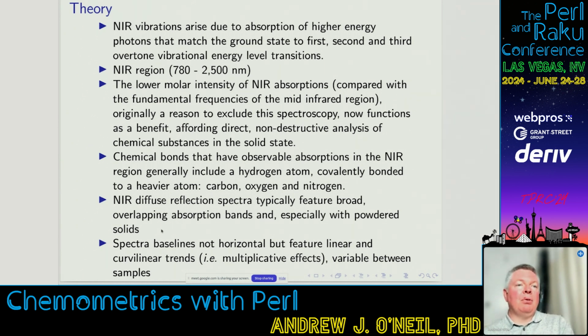And there are a lot of benefits there compared with traditional wet chemical analysis, like HPLC, high performance liquid chromatography, where you have to grind samples down, dissolve them into particular organic solvents, pass them through a column, and record the ultraviolet absorption as a function of the time it takes for these things to elute off the HPLC column.